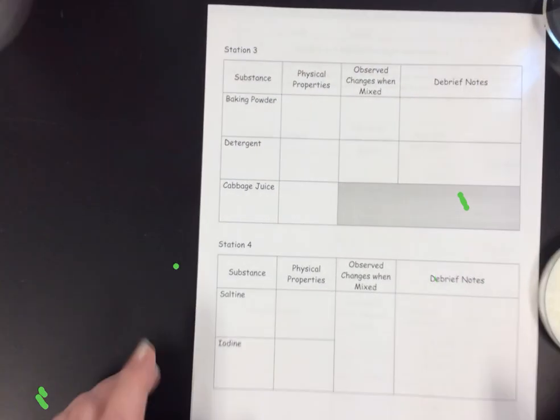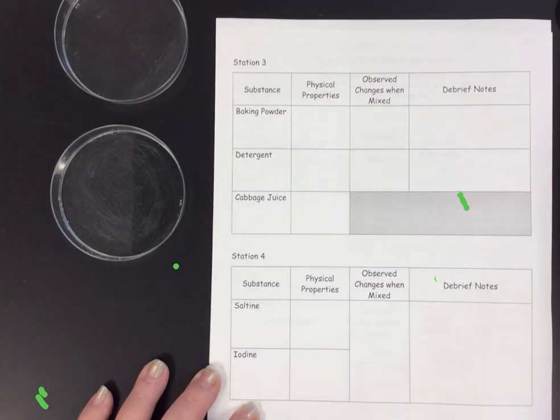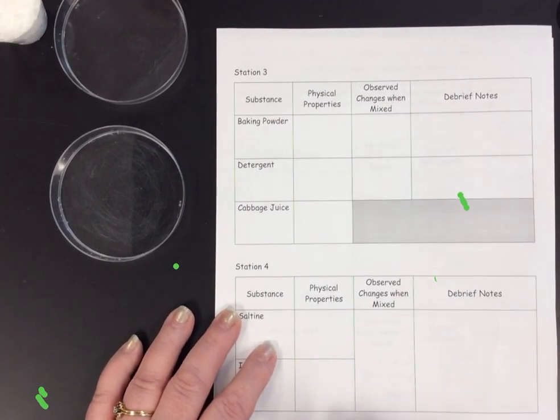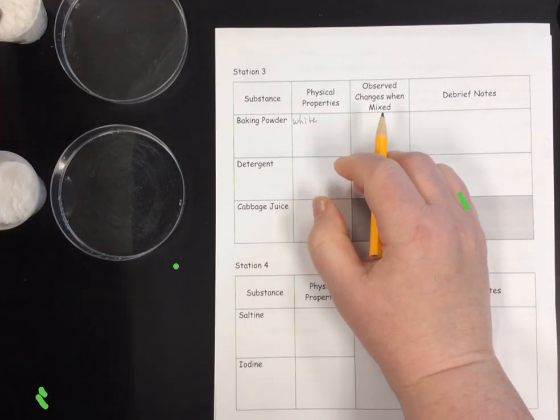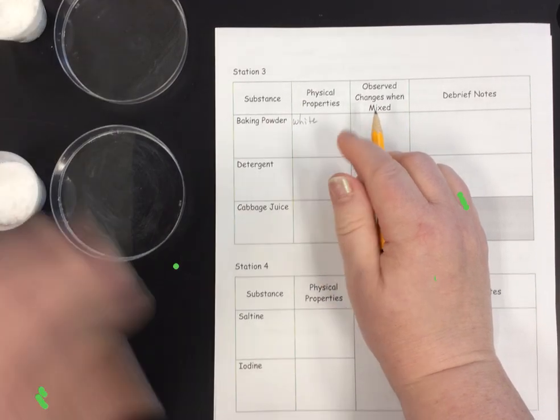Okay, now scoot over this way a little bit. We're going to use Petri dishes again on this third lab. We have some baking powder and some detergent, like the soap detergent that you use in your laundry.